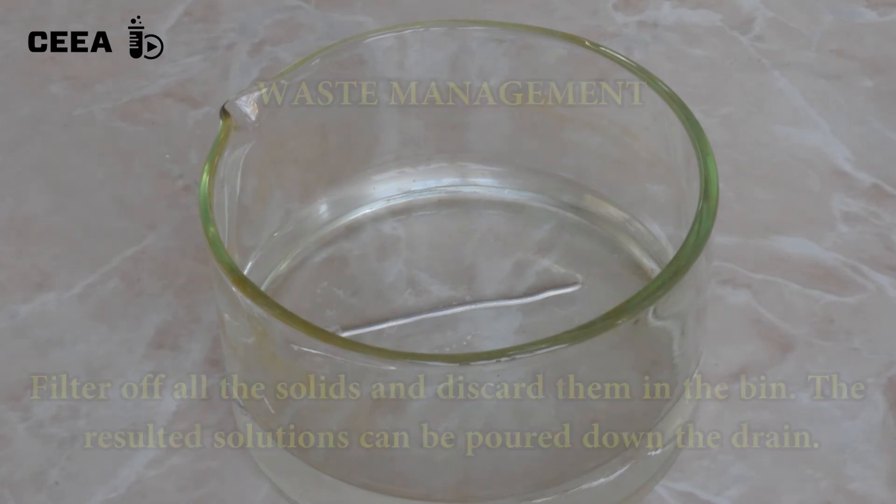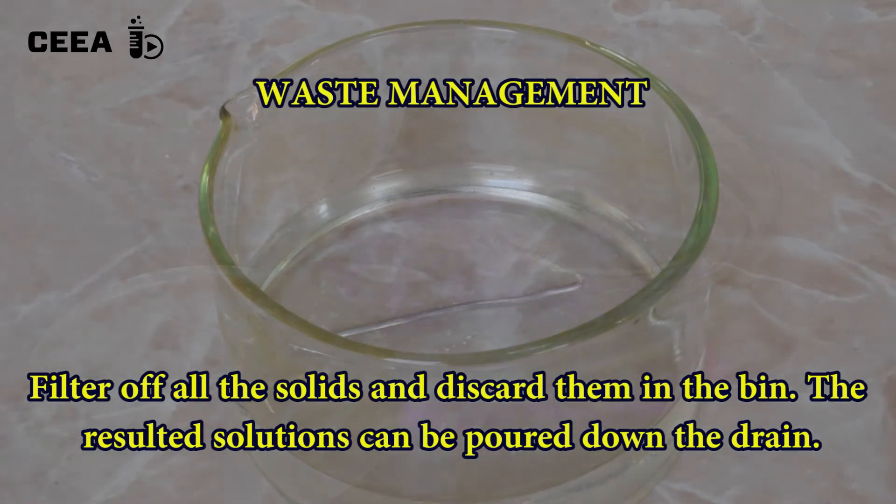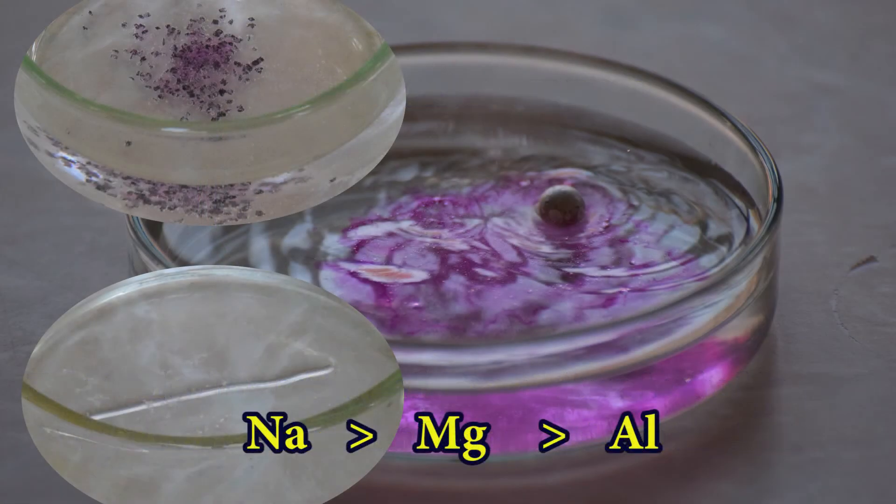To discard the waste, filter all the solids and place them in the bin. Comparing the reactivities shown in the reaction of the studied metals with water, we can state that sodium is the most active and aluminium is the least active of the three studied metals.